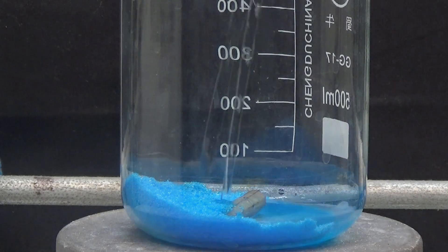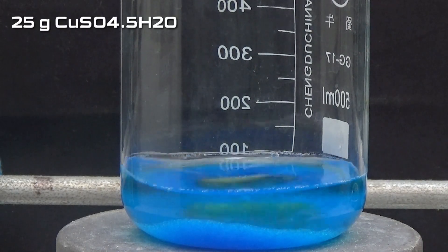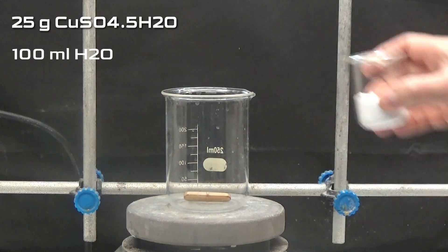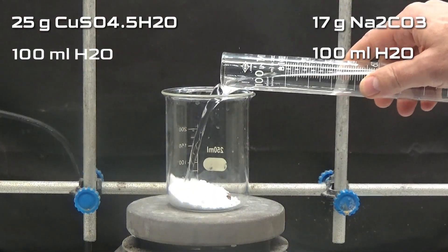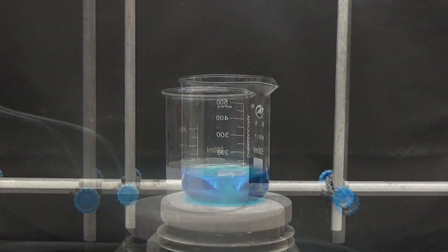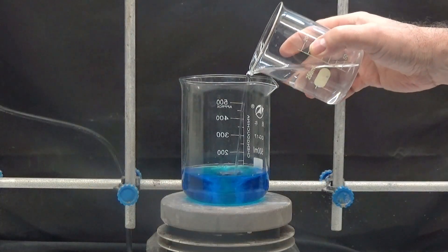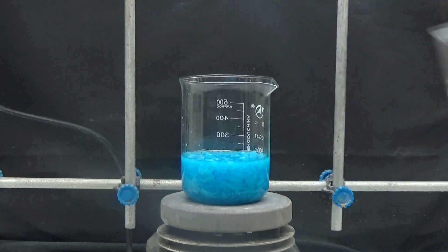I prepare two solutions: a solution of 25 grams of copper sulfate pentahydrate in 100 milliliters of water and another solution of 17 grams of anhydrous sodium carbonate in 100 milliliters of water. Add the carbonate solution over the copper sulfate solution and a blue colored copper carbonate precipitate is formed.